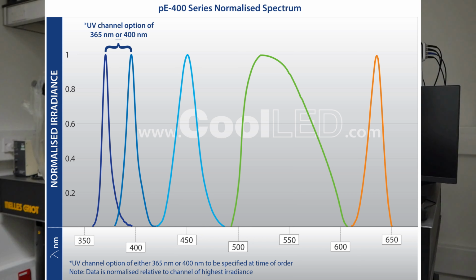One of the key misunderstandings that people typically have about LEDs is that they aren't a white light source. A white light source is extremely broad over the whole spectrum. An LED tends to have a very discrete peak. However, it does have some breadth to it. It's not like a laser line. It typically covers between 20 to 30 nanometers and sometimes even broader.